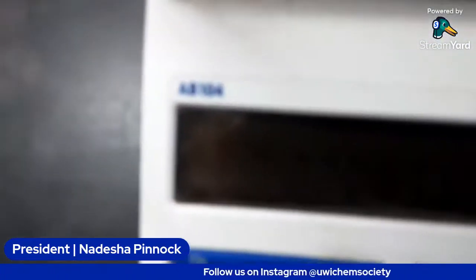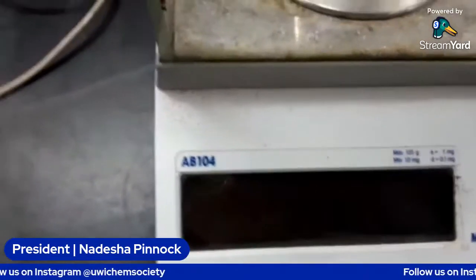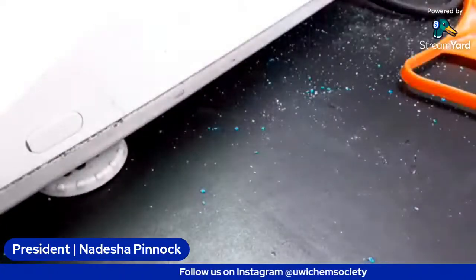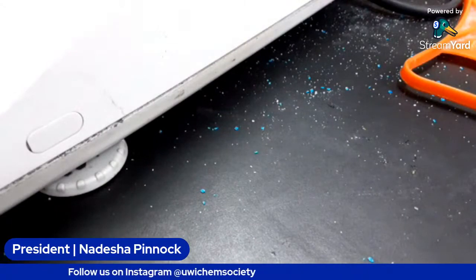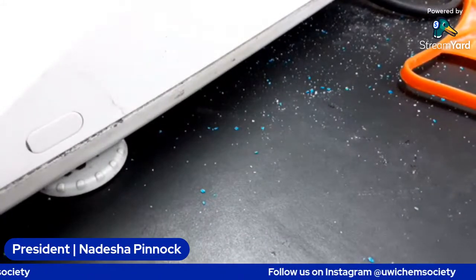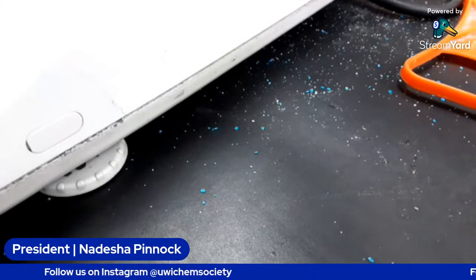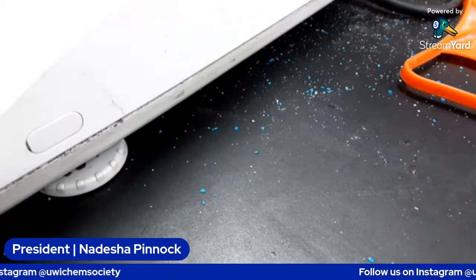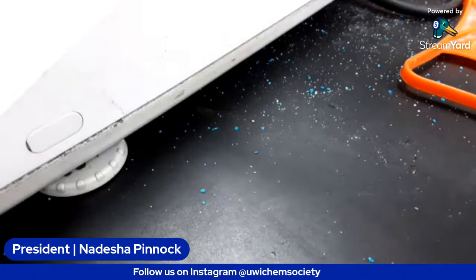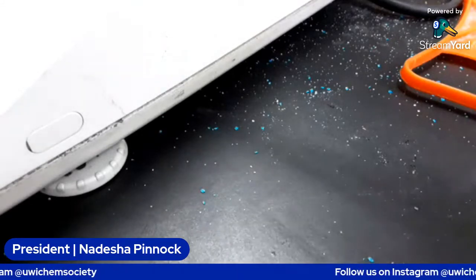So once we zero the balance, then we're going to add in 5 grams. Since we said we're going to use 50 ml of liquid, we would just half the amount of potassium iodide we add. So I'm just going to add it. You guys may not be seeing just because I'm using both my hands.